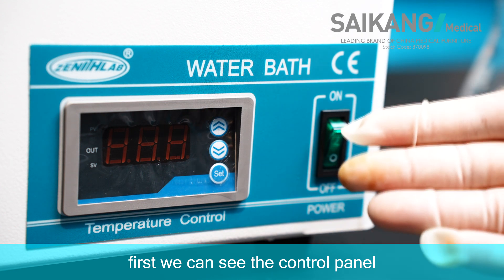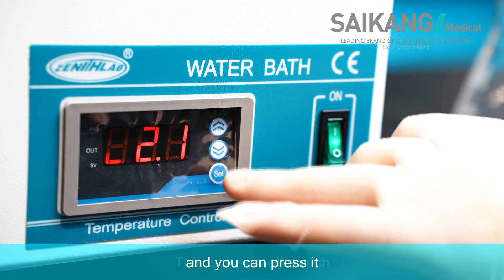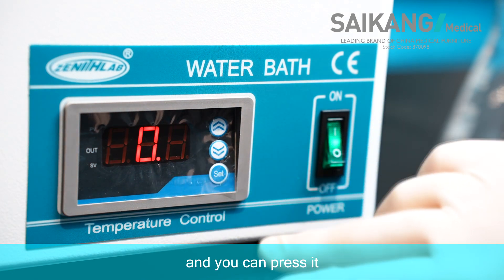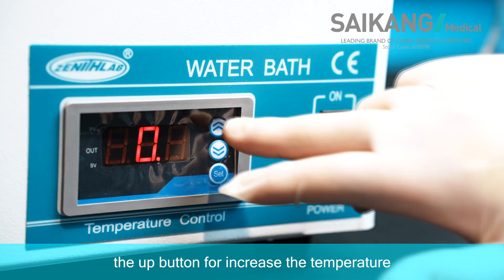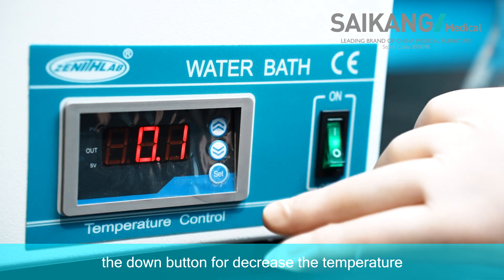First, we can see the control panel. This is the on/off switch and you can preset to adjust the temperature. The up button is for increasing the temperature, the down button for decreasing the temperature.